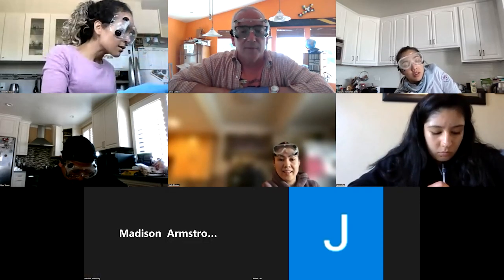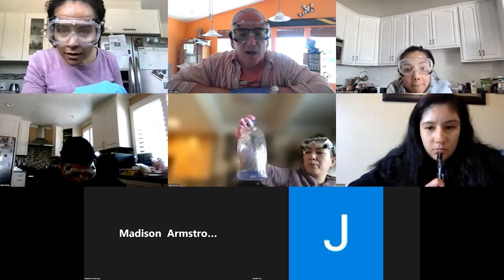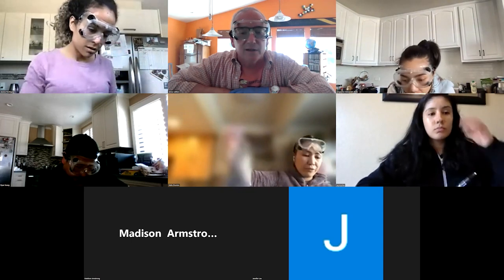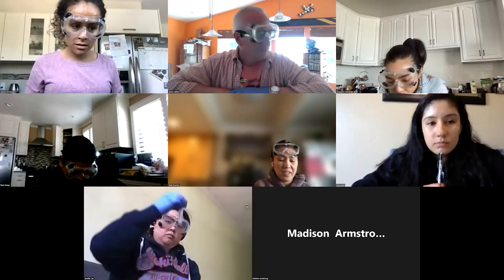Okay, so the pH, I think I got a pH of 8. Ooh, what was your soap? It's soft soap. Interesting. At first it's 7, like 6.57, and then after a few minutes it turned 8.